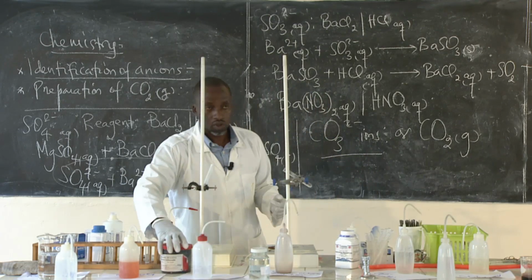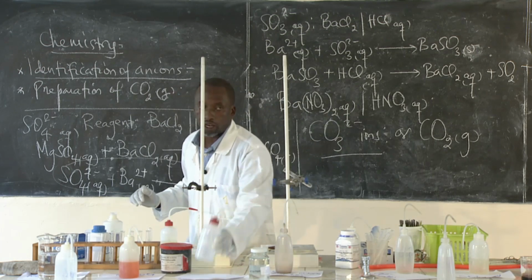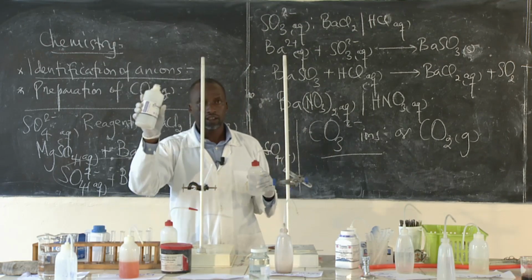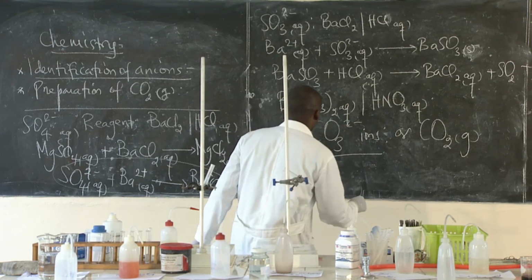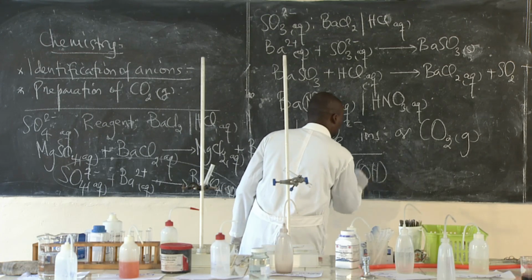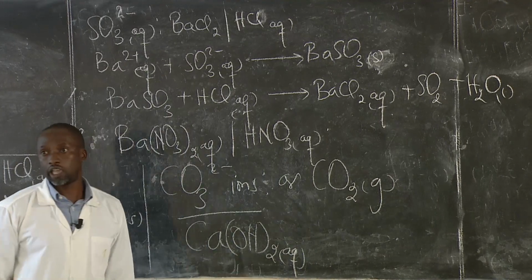Well, the reagent that we use is simply lime water. So we have lime water here. That is what we use. Lime water is a solution of calcium hydroxide. A solution of calcium hydroxide is called lime water.